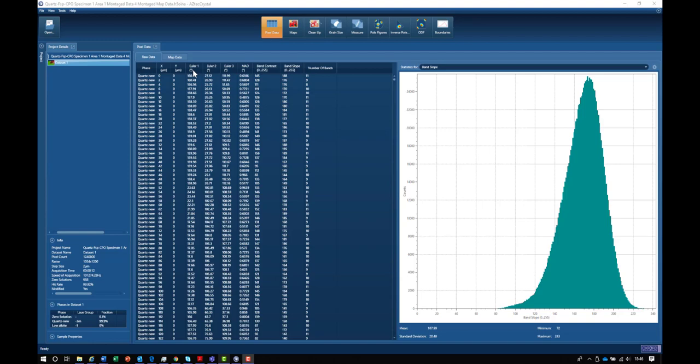In this form, the table doesn't help us very much. So what we do is take that data and plot it in the form of maps.